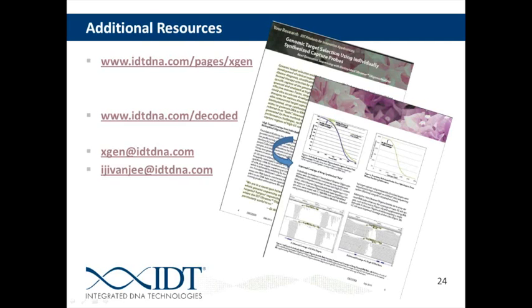Right, it would kind of depend on the application. If you're doing genome sequencing, it's probably not necessary, but if you're looking at a specific region, they'd have to do a pretty custom design. Yeah, we would definitely have to do a custom design for that, and as Ibrahim has mentioned, that's something we can definitely help customers with. We can help walk you through how to design these things, and we can give some advice on parameters that should be used for the different types of design in different organisms. Okay.